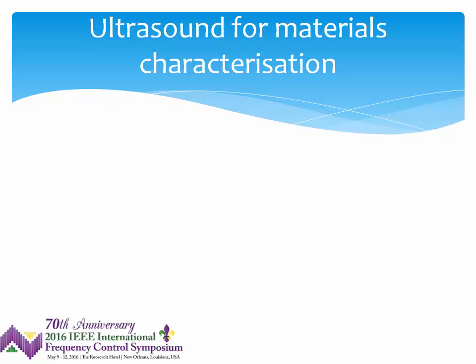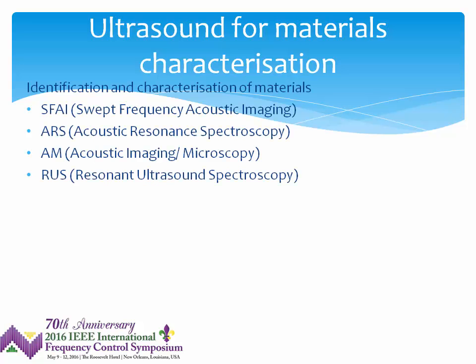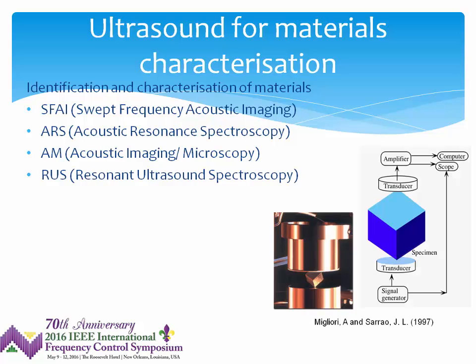this work really builds on the wider application of ultrasound for materials characterization, and there have been a number of techniques that have been developed in the past. Some of these are shown here. These are typically applied at much larger, macroscopic length scales, and some of them combine resonance-based techniques and spectroscopic techniques to probe material properties. They're applied to a range of problems.